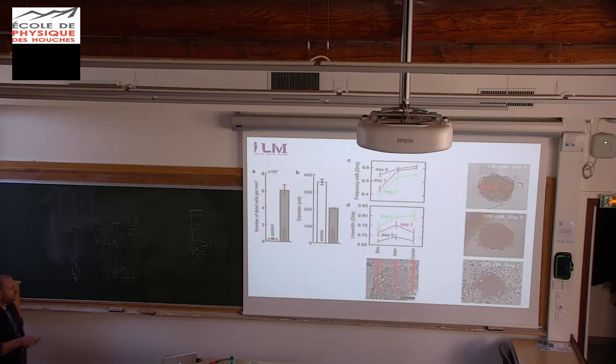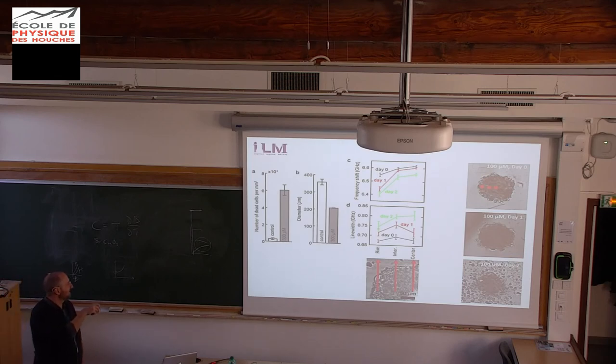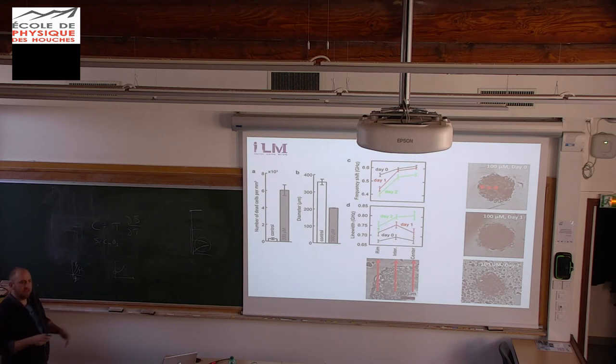And if now we put drug, this is just imaging. At the beginning, you have this size, and you see that the cancer tumor cells are destroyed. So we put a huge concentration of drug. Okay, we wanted to go fast. On the control, there are no dead cells, so it's fine. We really see an effect of the drug.